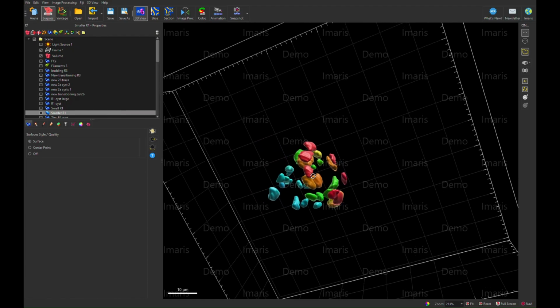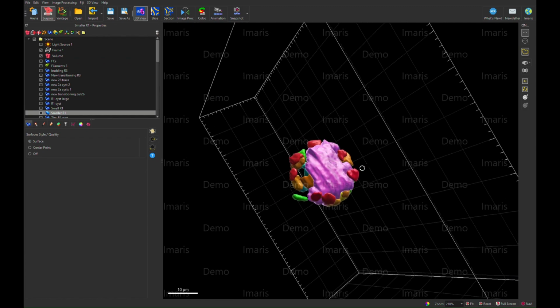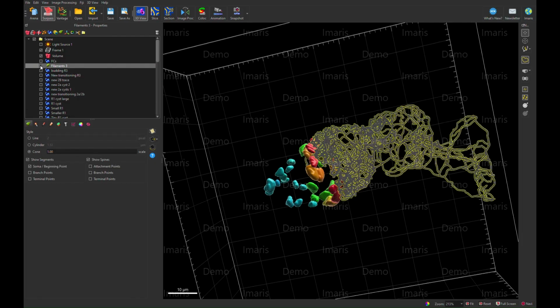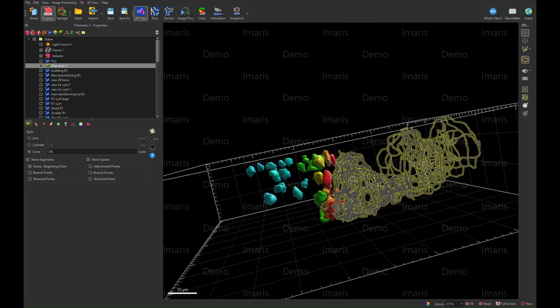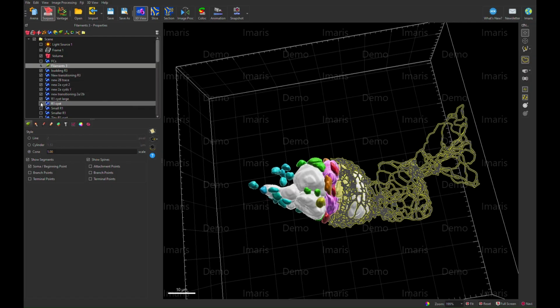And I'll bring back the 2B cysts as well so you can see just how tightly packed this space can be, right? So you can see how those red cells are really squeezed in there. These cells, again, are going to have long projections that are going to help frame this 2B cyst as well. But they are not encapsulated by Fas3 yet, so they're still undifferentiated and still considered follicle stem cells. All right, so let's just bring everything back and look at this holistically one more time before the end of this video.